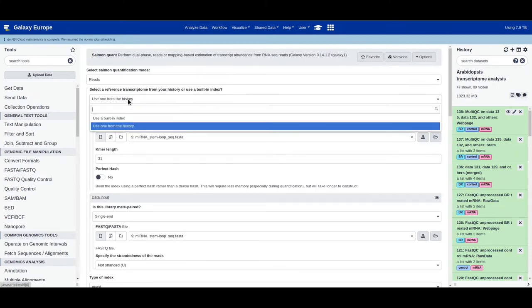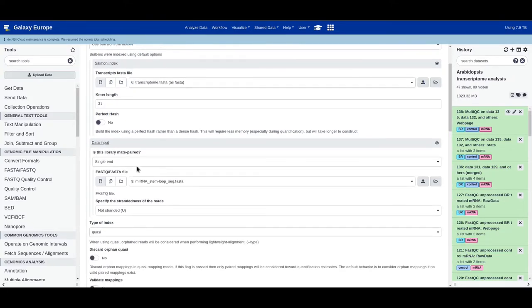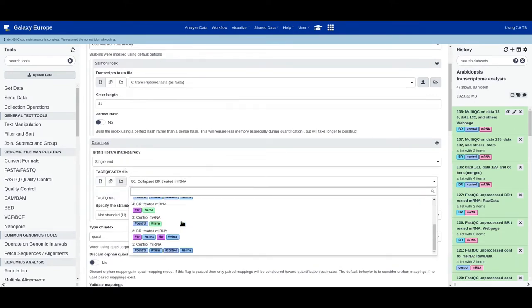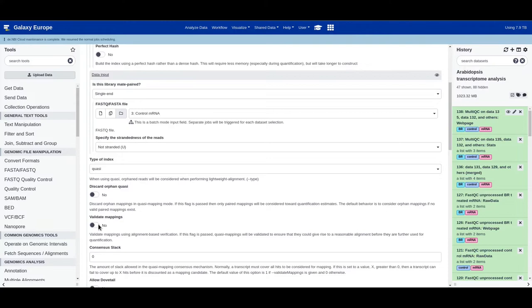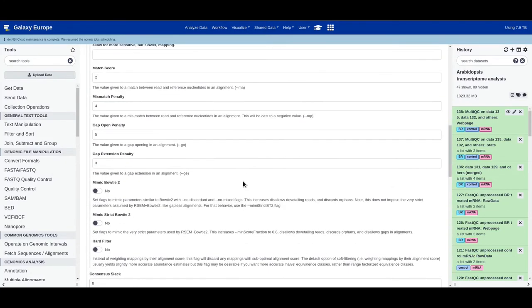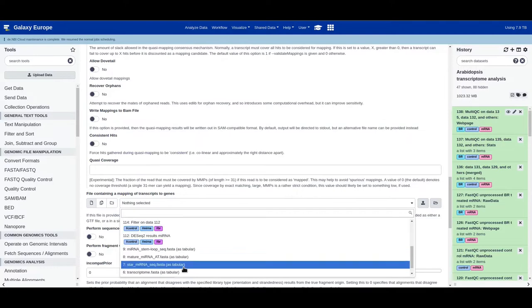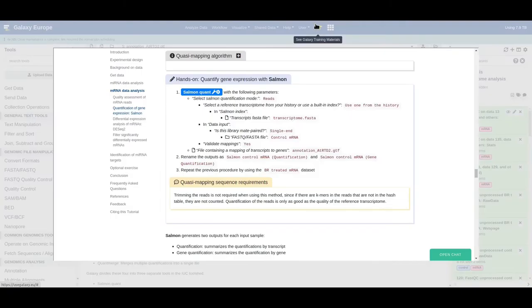Let's now perform mRNA quantification using the Salmon quant tool. Choose the reference transcriptome from the history, select the transcriptome FASTA file, leave the k-mers as they are, and select our FASTQ files dataset collection — starting with the control mRNA collection. Set 'validate mappings' to yes, then select the file containing transcript-to-gene mapping, which is our GTF file, and click execute.